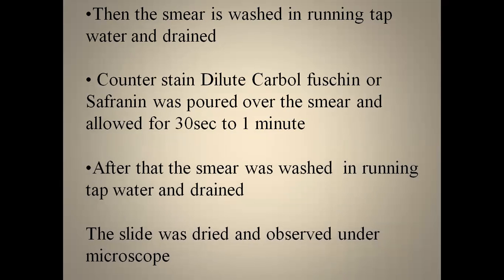Then once again, you have to wash the smear in running tap water.